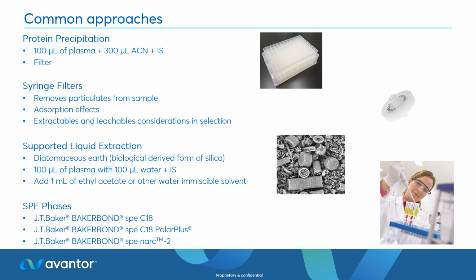system. Syringe filters can also be used, and this removes particulates from the sample. One thing to be aware of is that it doesn't remove proteins, and so therefore this technique might need to be used in conjunction with other forms of sample preparation when dealing with bioanalytical samples.